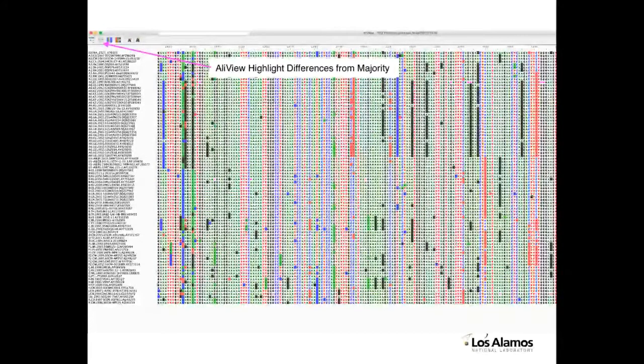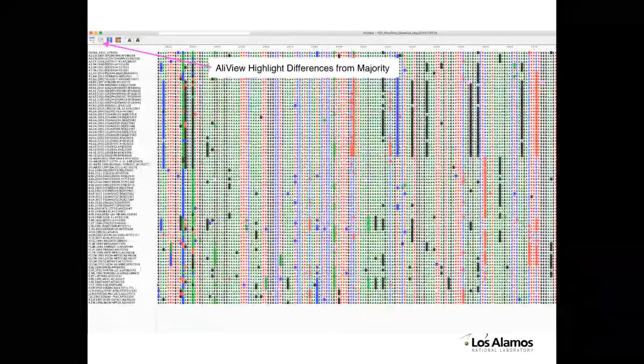Here I've highlighted a single sequence that's a recombinant and am showing you how that looks. So here we're seeing a lot of differences between my query sequence and A6, but it's very similar to A6 in this whole region. And then below, I can see that it's different from A6 here and more similar to B over in this region. So this is an AB recombinant.